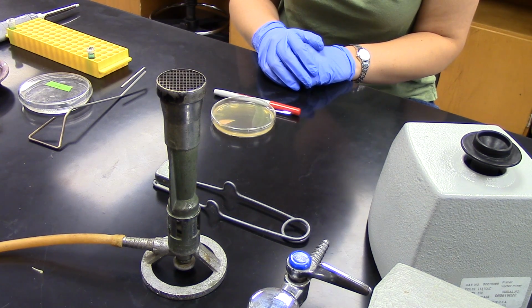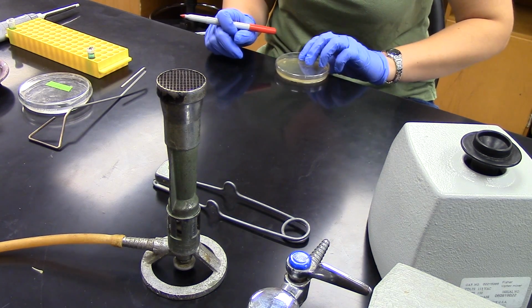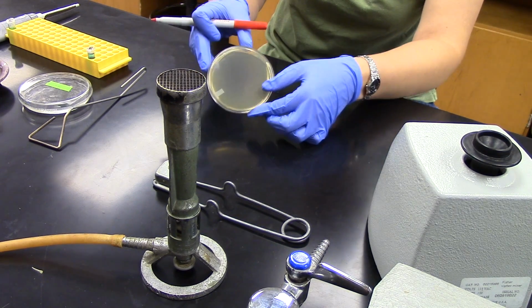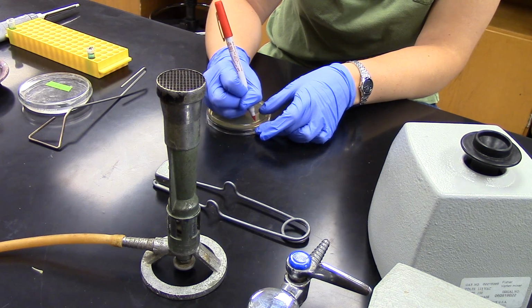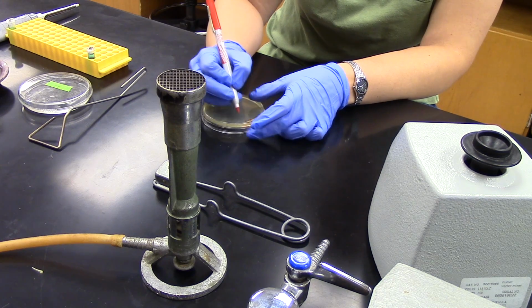Okay, so when you're plating bacteria, yeast, whatever it is, you want to, of course, wear gloves and use pretty good sterile technique. Before you begin pipetting anything, you want to start by labeling your plates. You always label the agar side of your plate, and you do it around the edge so you don't block your view of the majority of your plate. Include things like your name, the date, your lab room, what you're putting on the plate, any treatments that you're doing, things like that.